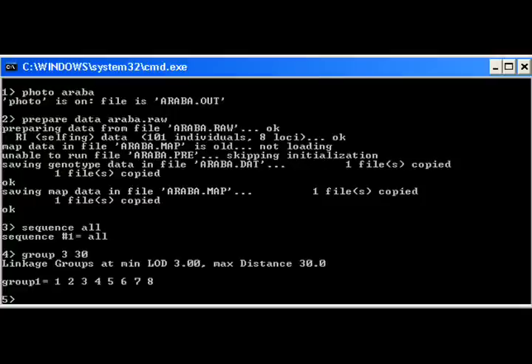Group command instructs the program to create linkage groups based on the criteria: LOD greater than 3 and distance less than 30 centimorgan.